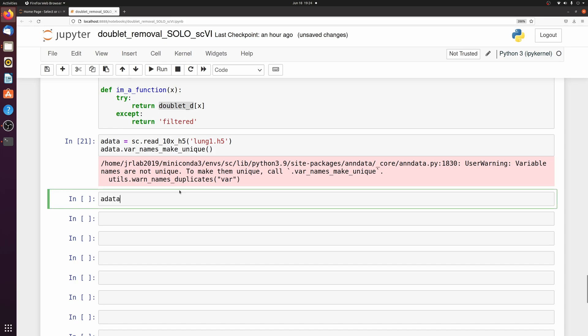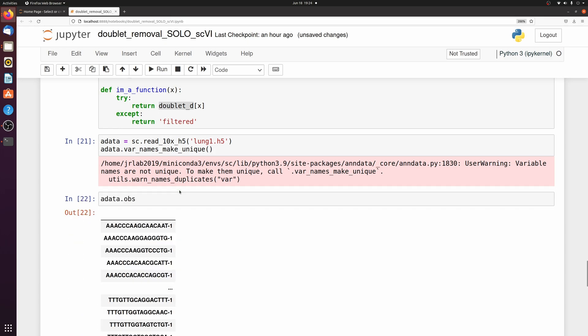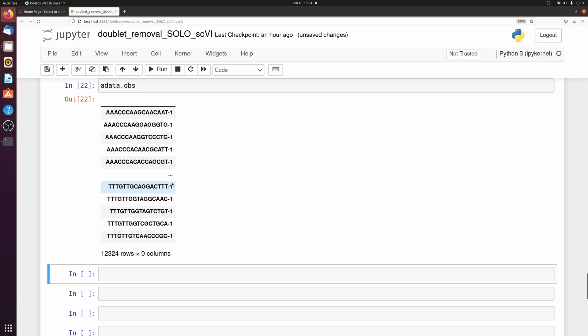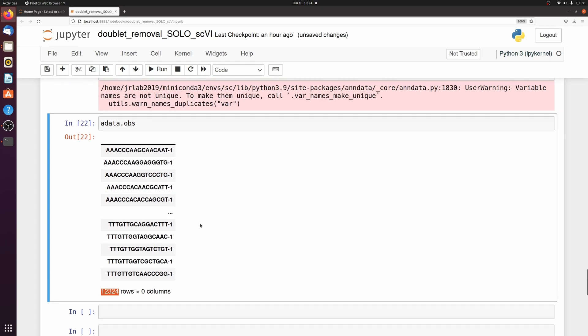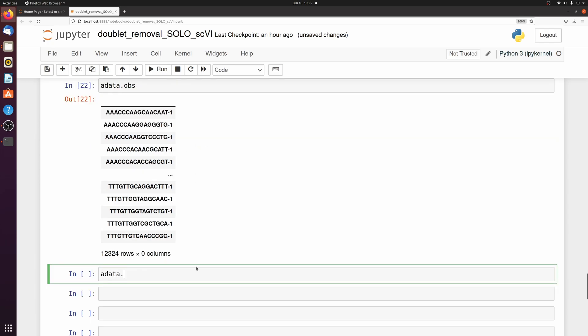So if we look at adata.obs, we have those 12,300 unfiltered cells. And then now let's map a new column as to whether this is a doublet or not.